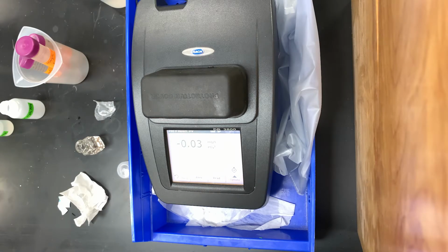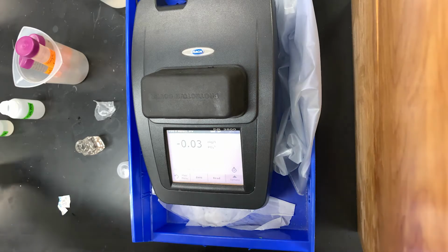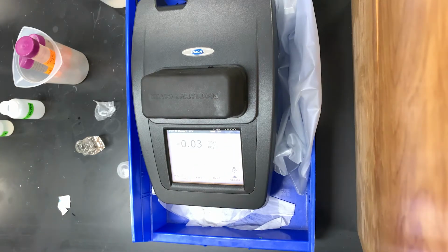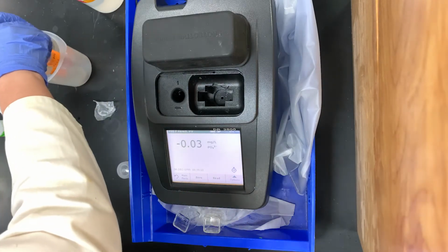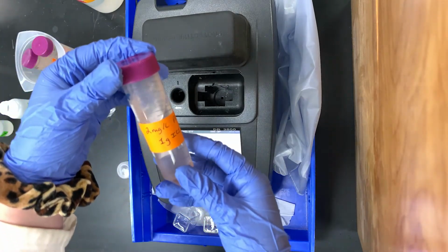So we're actually getting a negative concentration for this standard, and this is just likely due to there being 0 phosphate left in the solution. So that just means that the sand was able to absorb all of the phosphate from the solution. So this final concentration of the 1 milligram per liter solution is effectively 0.